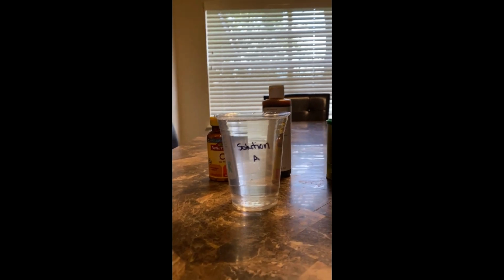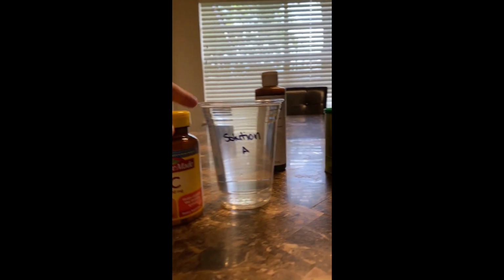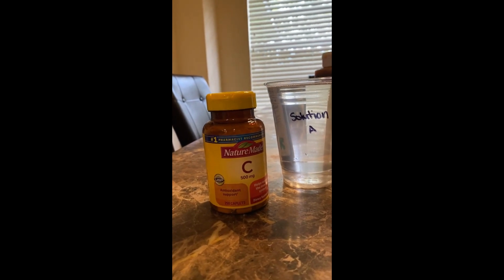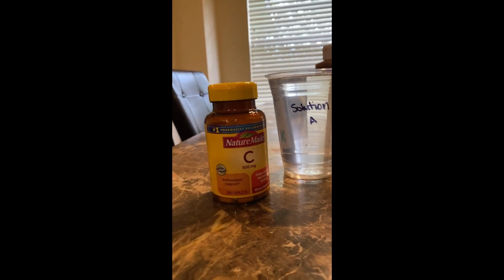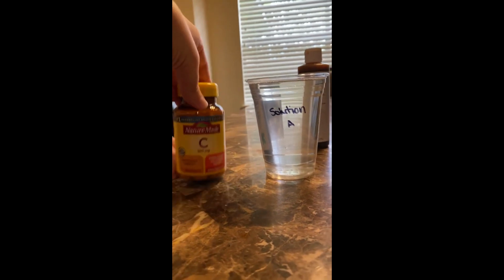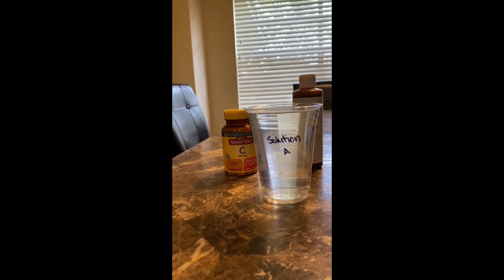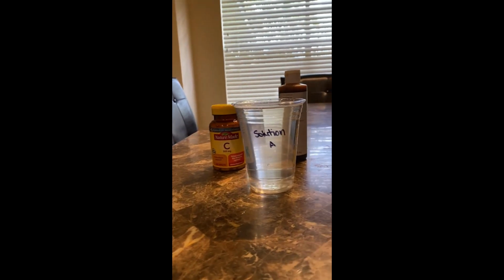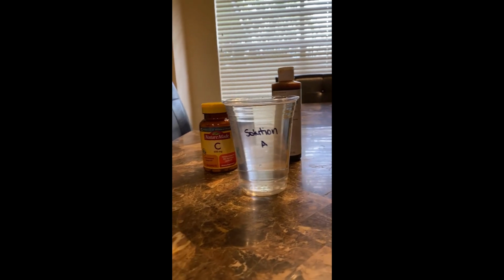In solution A, I have 4 crushed up vitamin C pills that I crushed with a, what's the thing called? I can't think of the name. I crushed them up into a powder, and then I filtered through about 2 coffee filters to make it clear.